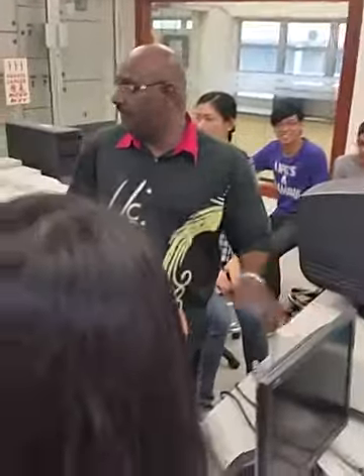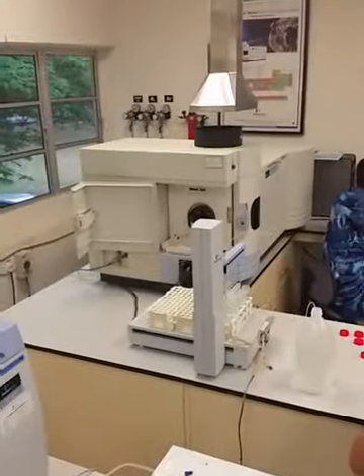Now the most important thing here is this. This one is an ICP OES. It's one of the latest equipment. It's very expensive.